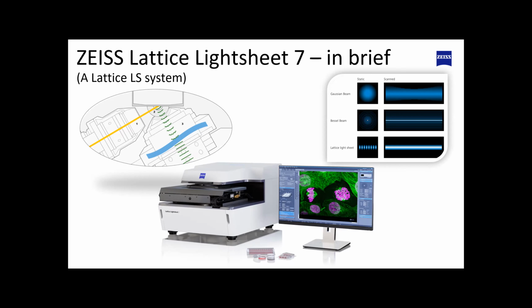The idea about both of them is that they bring in non-classical illumination in order to basically do a different modality of imaging. But this is kind of where it stops. Explaining the Gaussian light sheet, as I tried to do in the last 15 minutes that I had, is relatively easy. Explaining the lattice light sheet is a little bit more complicated because it involves nonlinear optics.